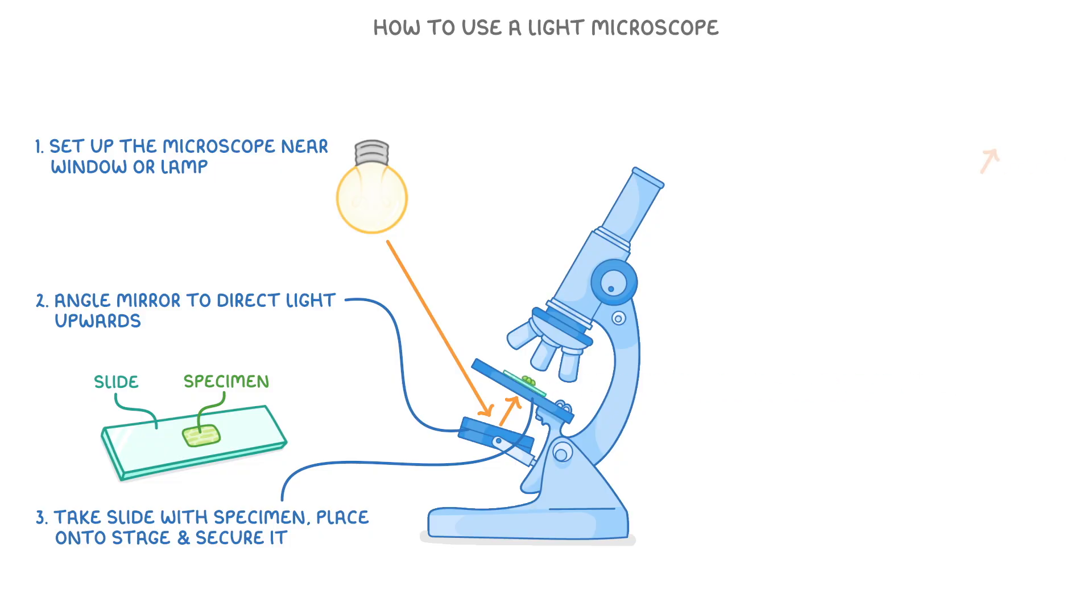And now that our slide is in place, we can look through the eyepiece lens and adjust the focus. So first we turn the coarse focus knob to get a rough image.